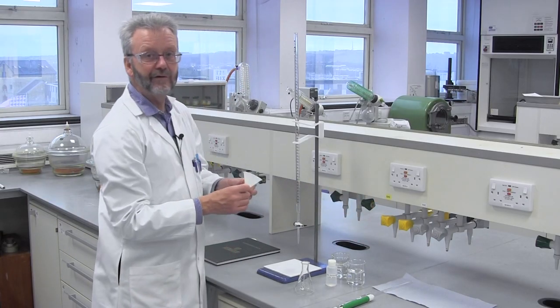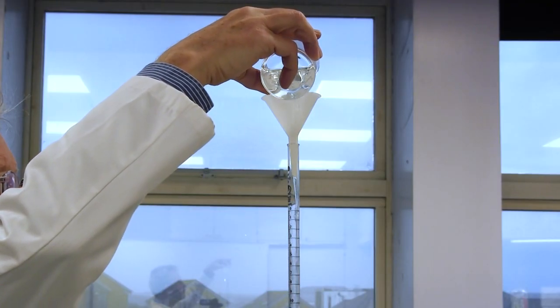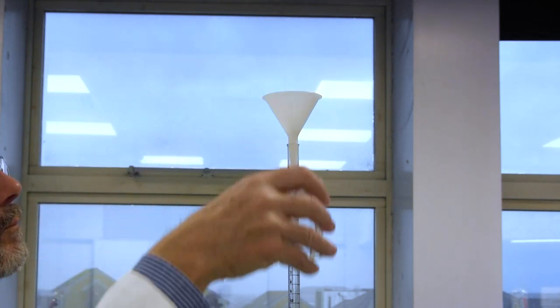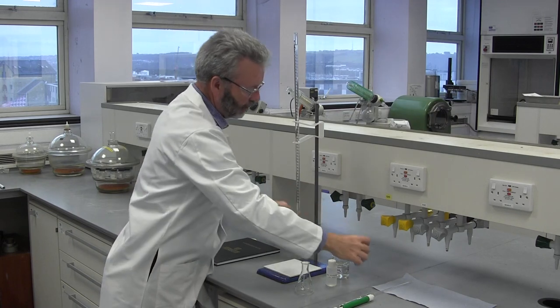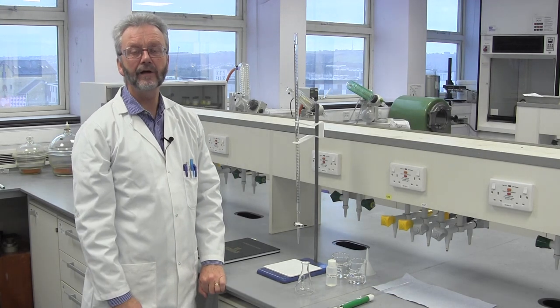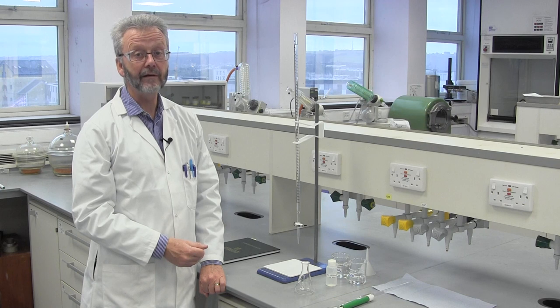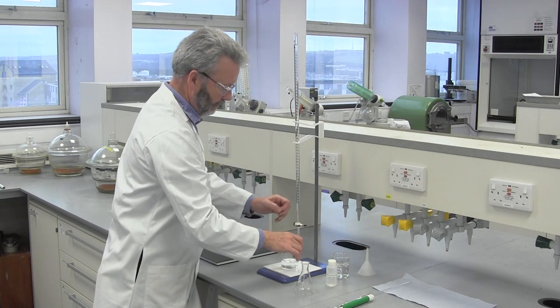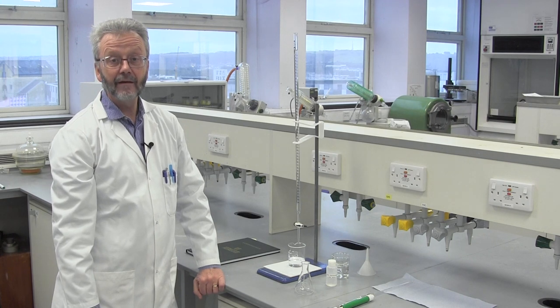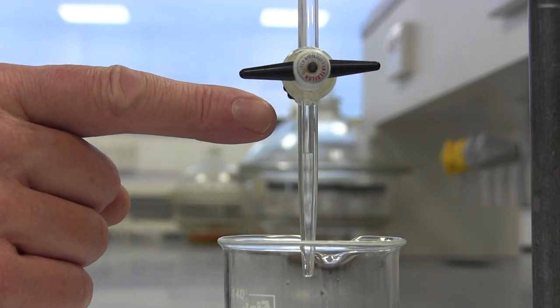Next we pour in the solution using the funnel — in this case, sodium hydroxide. We fill it beyond the zero millilitre mark. We do this because we need a continuous column of liquid from the top of the burette right to the tip. At the moment, the tap and the tip below it are full of air, not liquid. So we open the tap to allow the liquid to fill the space. It's important to check that there is no air trapped below the tap, which could come out during the titration and cause an inaccuracy in the volume measurement.